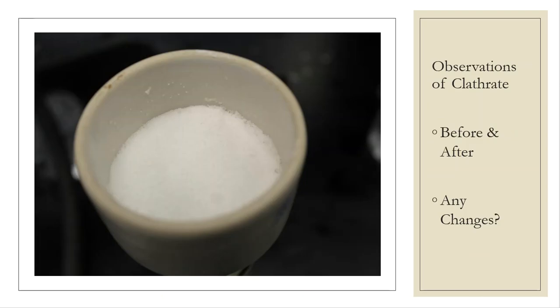Okay, so here's the Buchner funnel on top. That is what the clathrate looks like after it has filtered through. Okay, so once again, you can go through, talk about the changes of the clathrate, tell me what begins to happen, and then what I decided to do is I let this run 30 minutes.